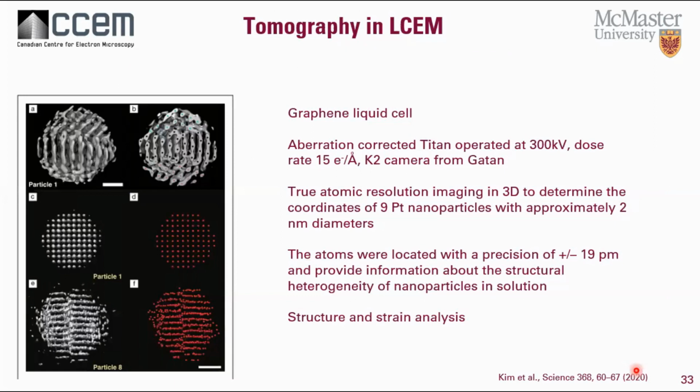These are a few examples which are published in the literature. And I wanted to show that other techniques than analytical techniques can be used in the liquid cells. So one of these techniques is tomography. And there are some amazing results in tomography obtained by the group of Kim in South Korea.